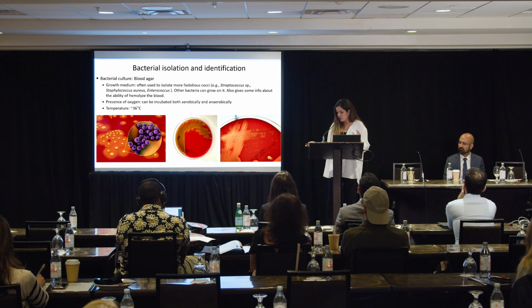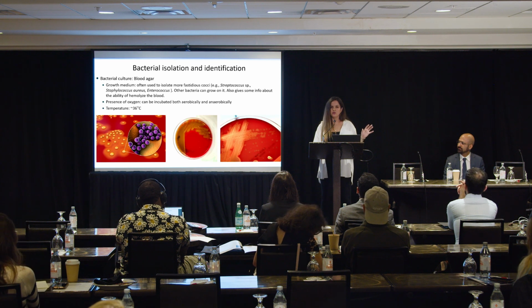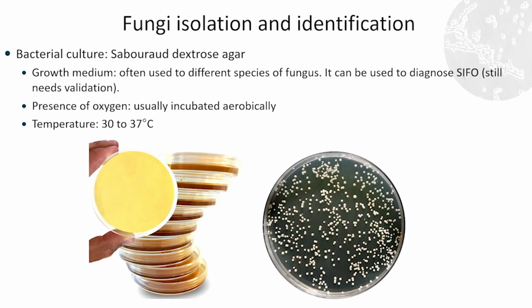So for the Reimagine studies, for the perspective on research, we mostly work with these two agars, MacConkey agar and blood agar. And the third one, that we are recently doing more research and understanding, is the one that I mentioned to you before, the Sabouraud agar to grow fungi. So it's mostly Candida albicans, but we have other types of fungi, yeast, that can grow in this agar.